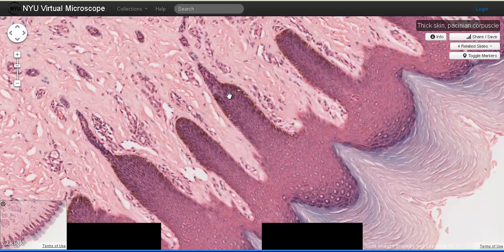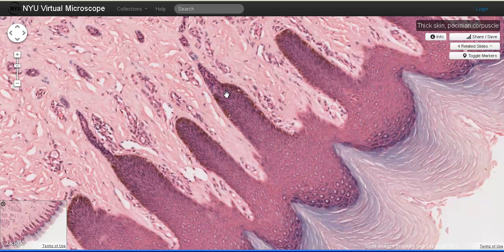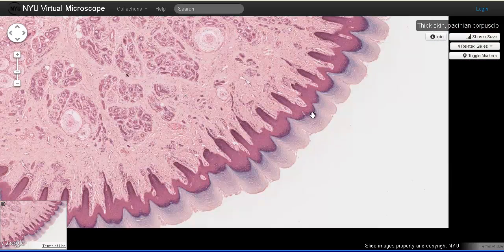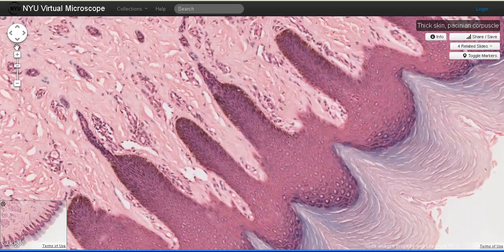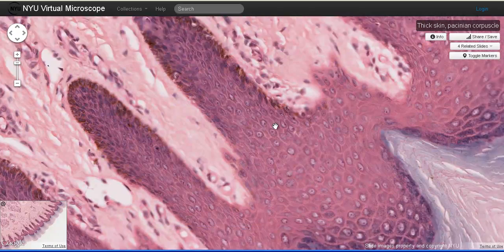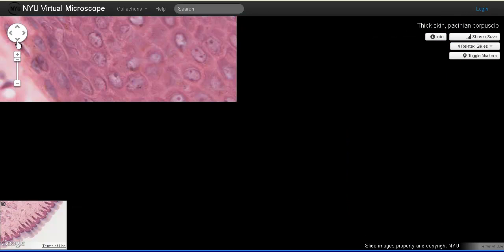The stratum spinosum extends from just above the stratum basale to this zone here, where we find cells containing some dark granules. This zone is referred to as the stratum granulosum. Here the keratinocytes are going to contain numerous granules in the cytoplasm.